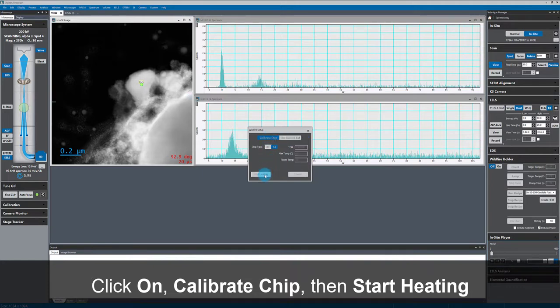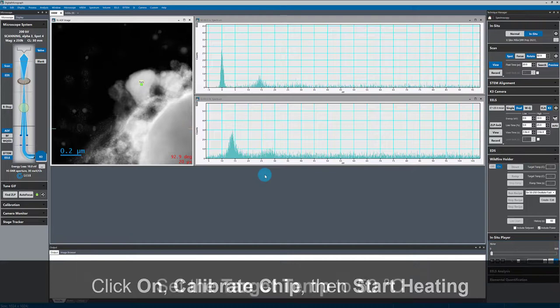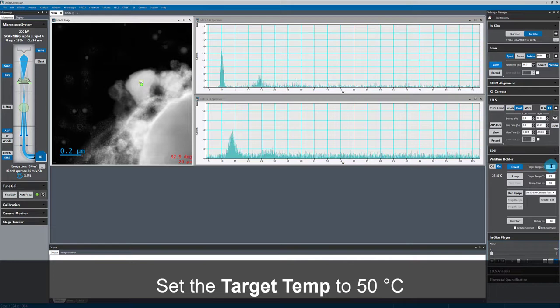The first thing I'm doing here is turning on a DEN Solutions Wildfire heating holder, which is controlled through GMS. I'll heat the sample to 50 degrees.